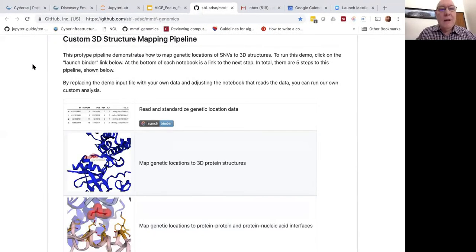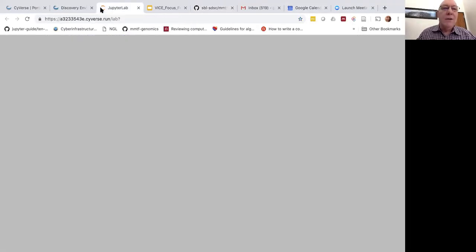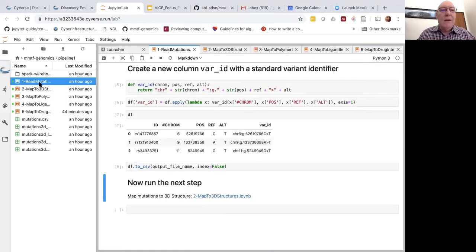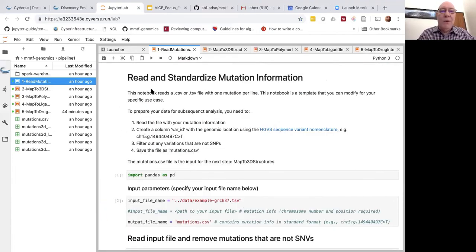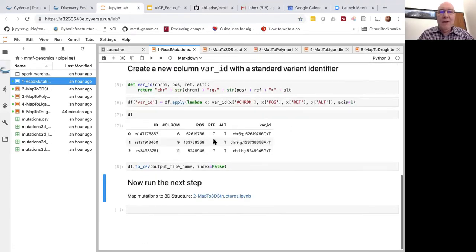All right. So rather than launching it now, I already launched the Jupyter Notebook in advance. So what you see here is what's called Jupyter Lab. In Jupyter Lab, you have a Jupyter Notebook, and as you see, there's text in here, then there's code in here, and tabular information, as you will see as I go through the demo. You can also have 3D structural information in here.